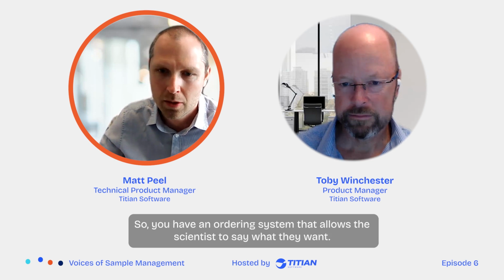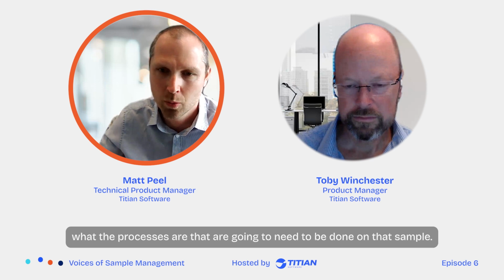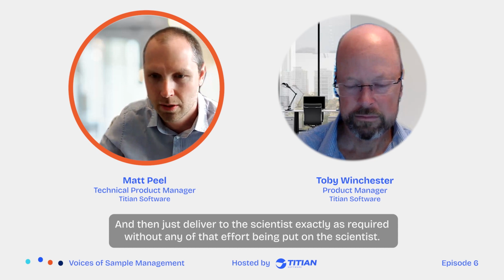So you have an ordering system that allows the scientists to say what they want, and then the ordering system will do all the calculations for you, working out what the best sample for your need is and what the processes are that are going to need to be done on that sample. And then the staff in the sample bank, who are experts in using the lab equipment, can then go and prepare those samples for you, and just deliver them to the scientists exactly as required, without any of that effort being put on the scientists.